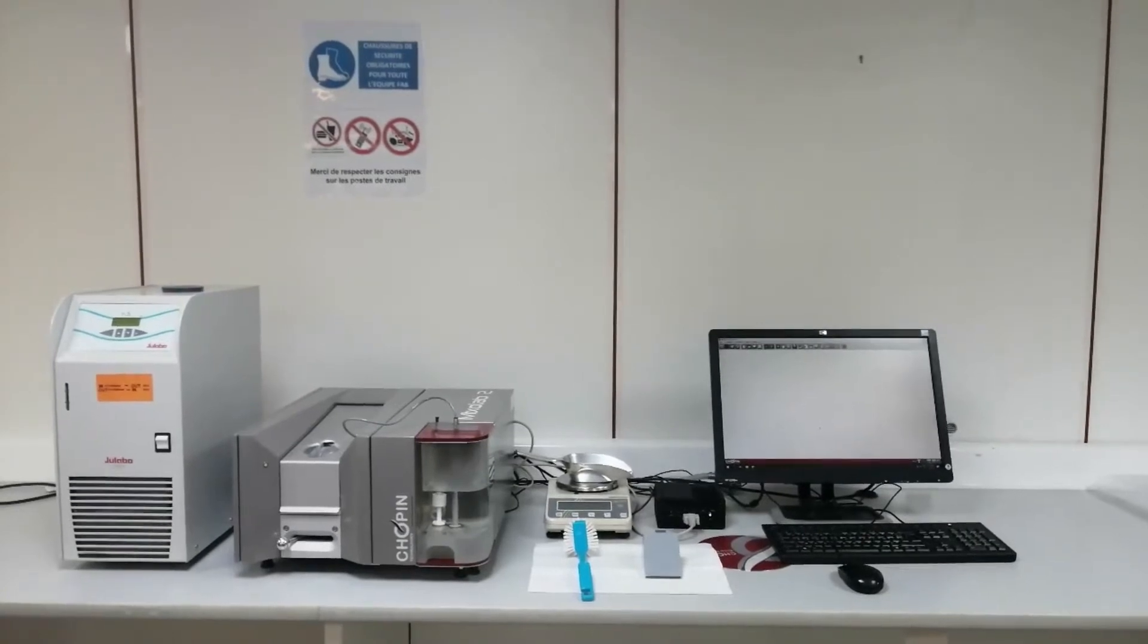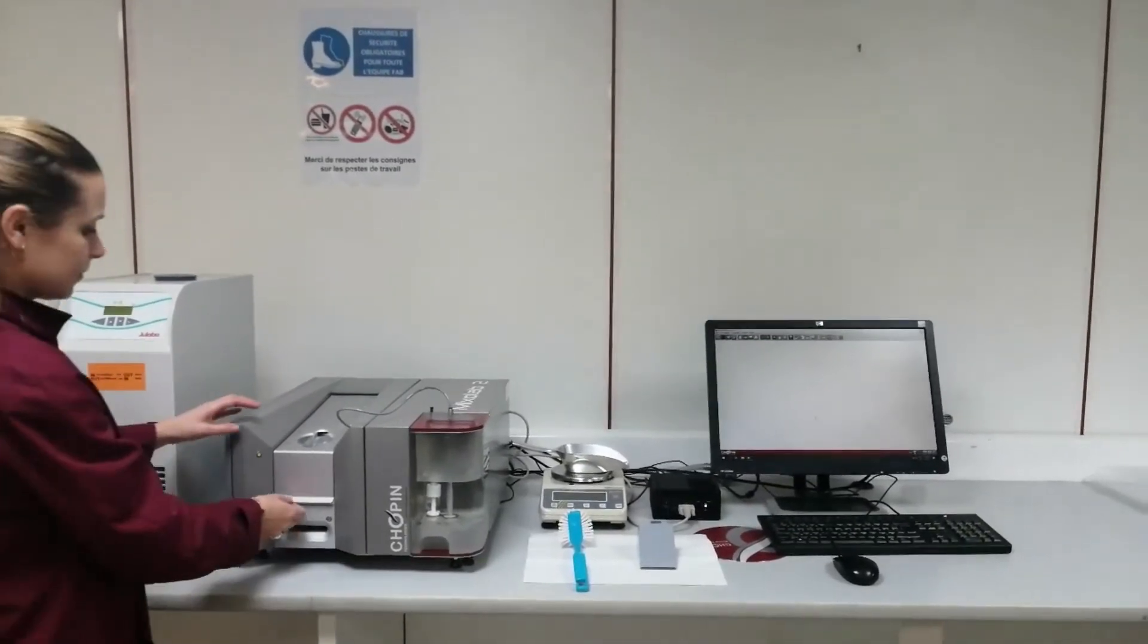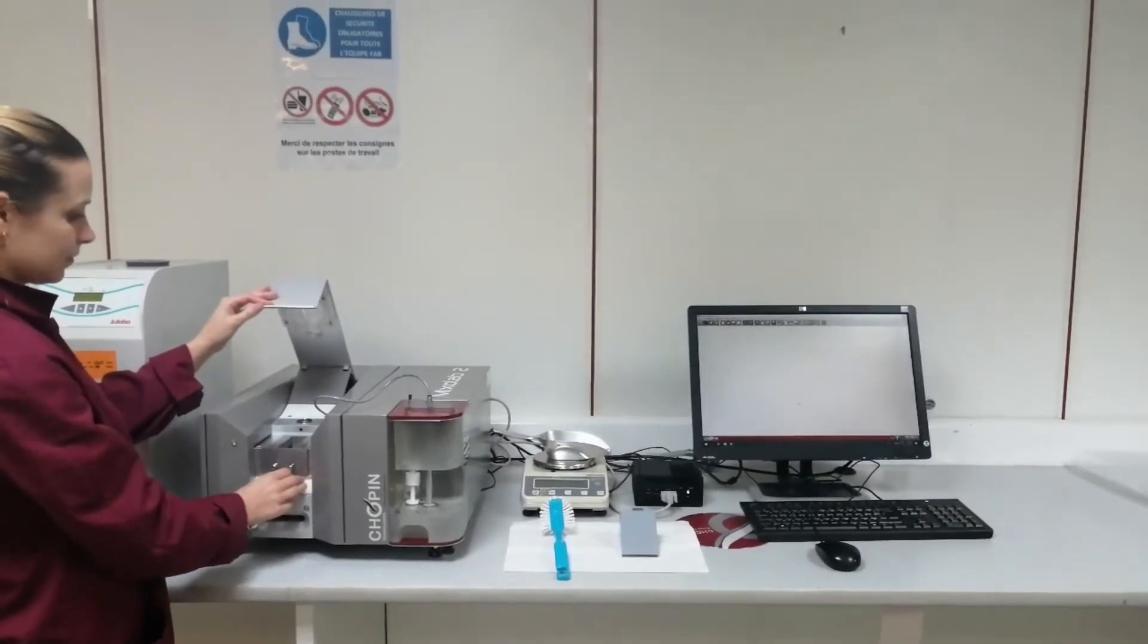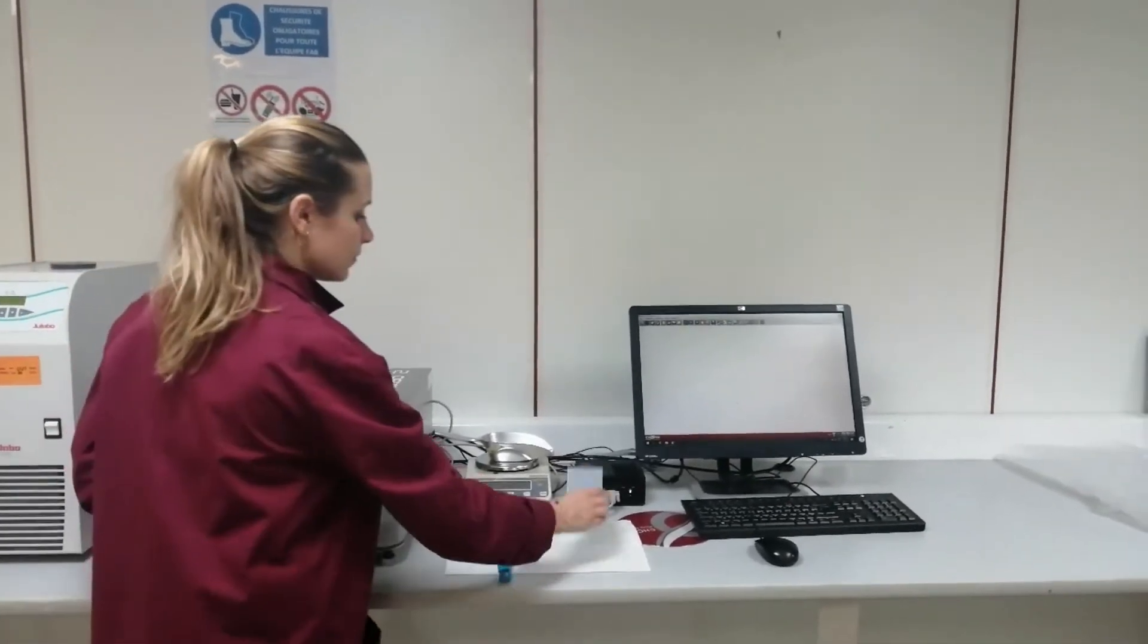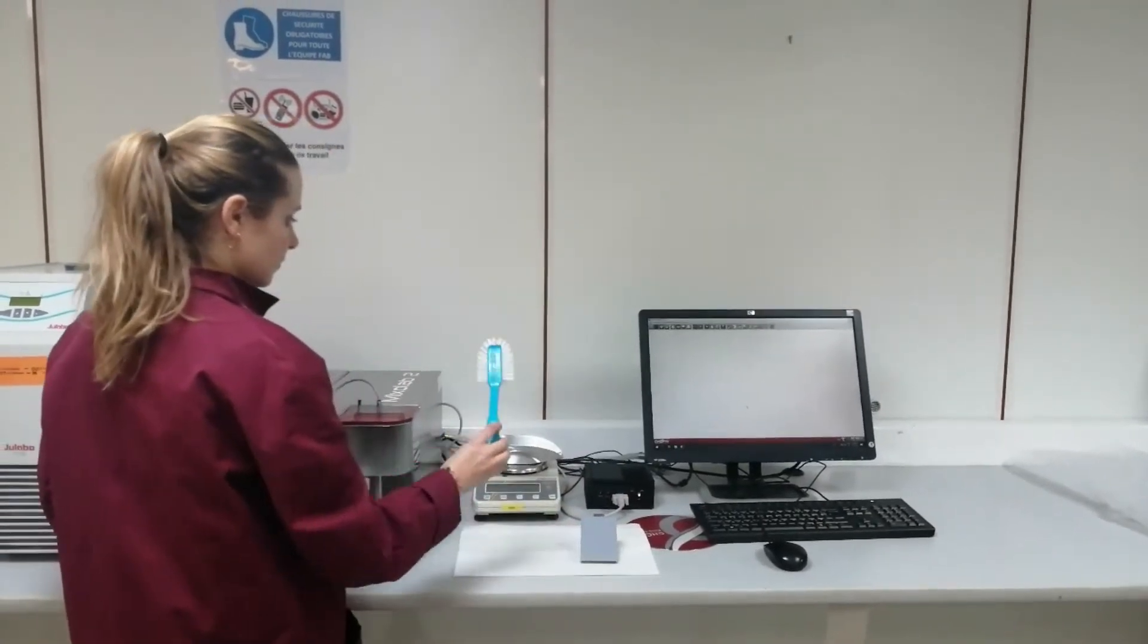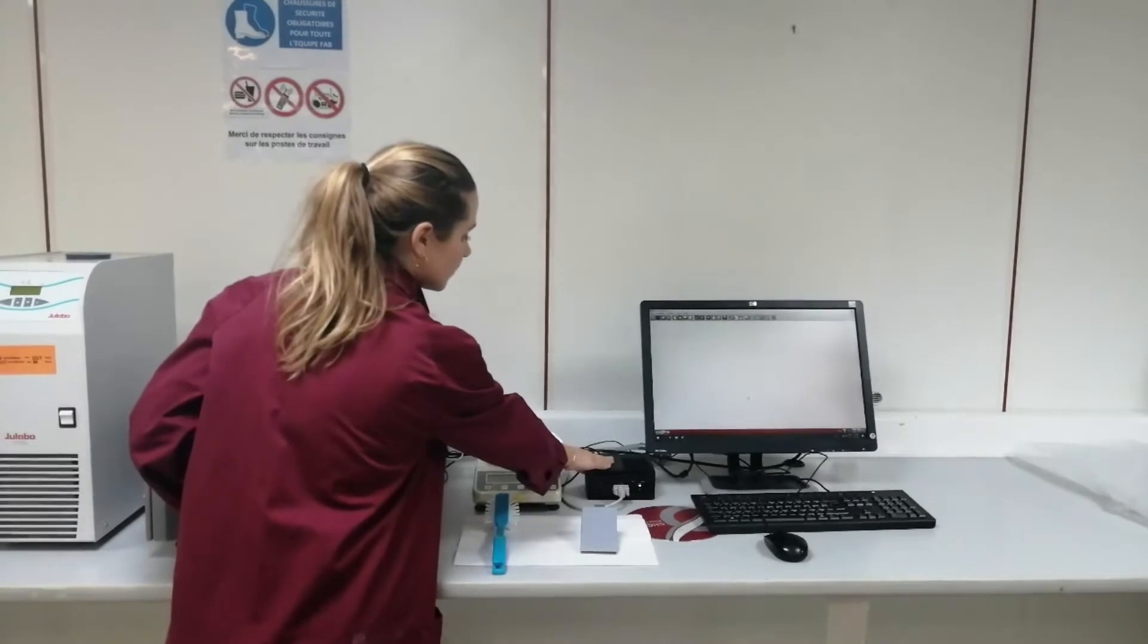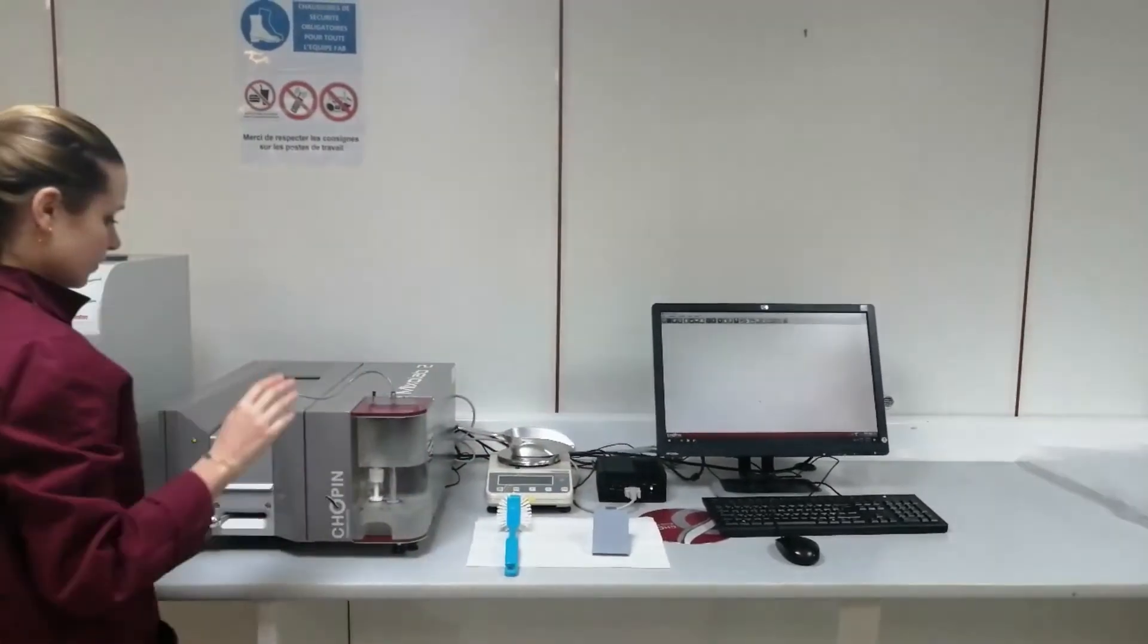The Mixolab 2 comes with one mixer bowl, here is clean and already in place, one filling hopper, one cleaning brush and one mini PC, a central unit dedicated to run the Mixolab.